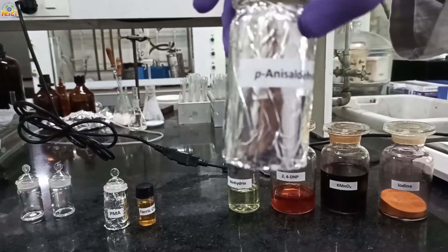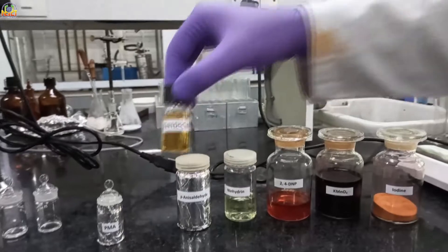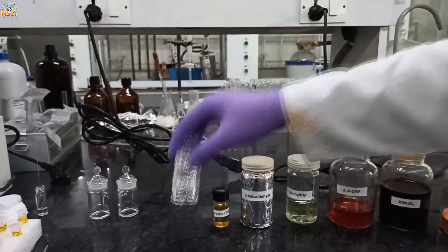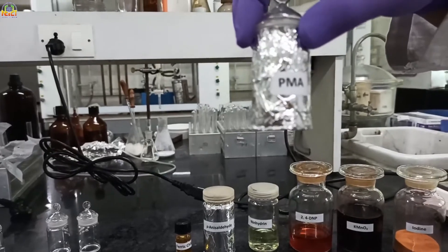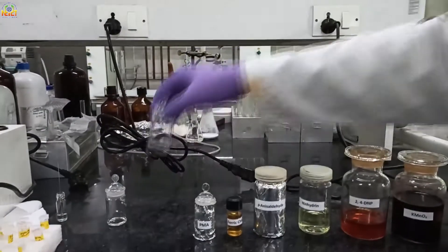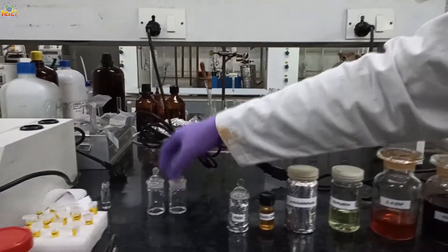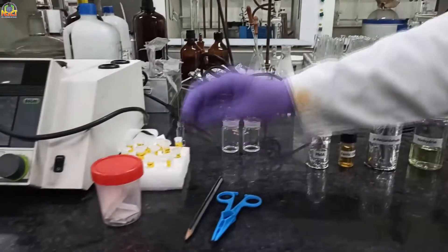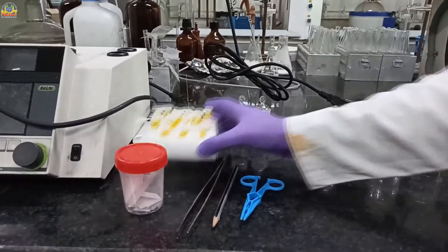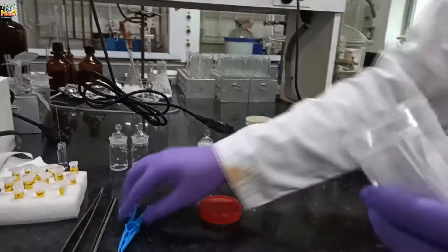This is Paranisaldehyde, coated in aluminum foil because it is an unstable and light-sensitive stain. This one is ferric chloride. This one is PMA, which is also a light-sensitive stain. These are TLC chambers in which we run the TLC plates, and these are TLC plates.